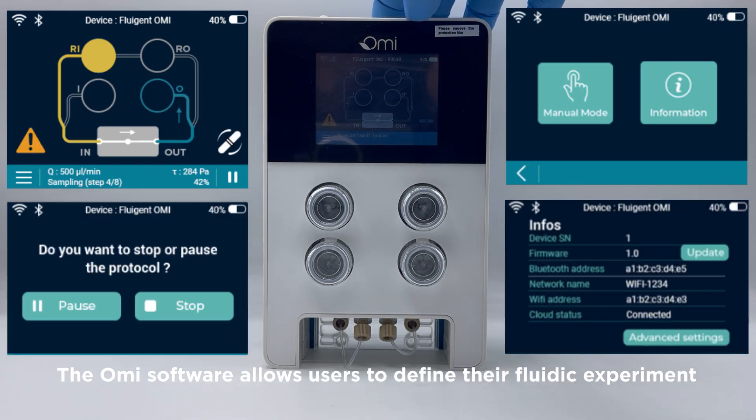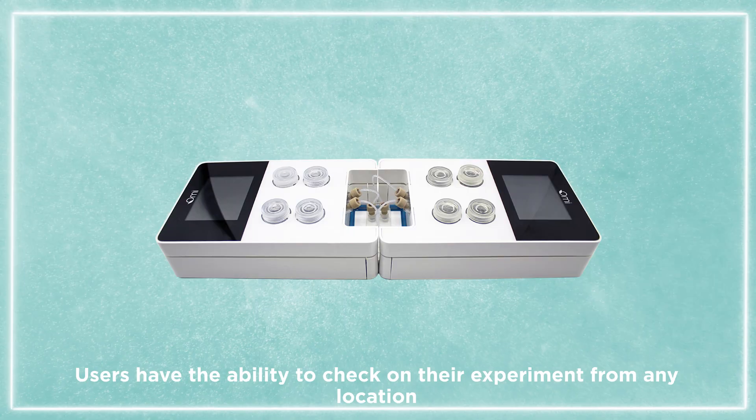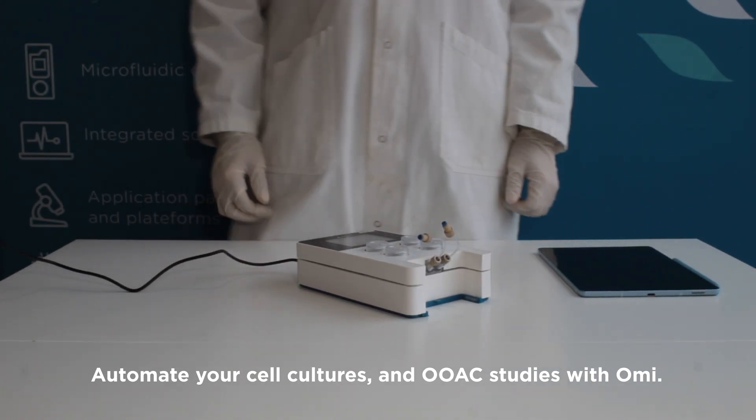The tablet is the interface between the OMI and the user. The OMI software allows users to define their fluidic experiment and follow the values of the applied flow rates and pressures in real time. Users have the ability to check on their experiment from any location. Automate your cell cultures and organ-on-a-chip studies with OMI.